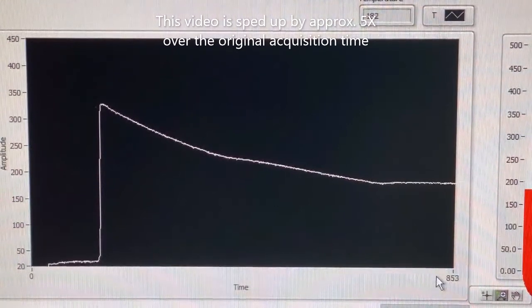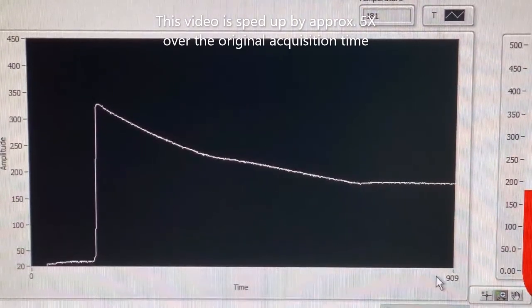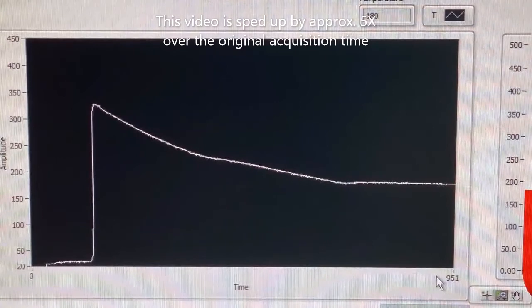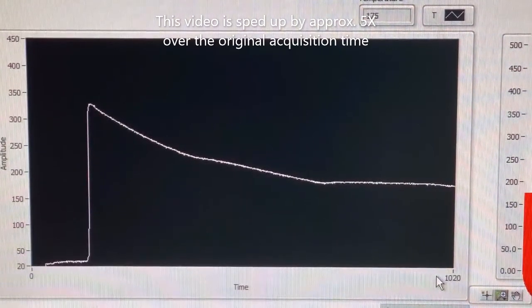So there is an isotherm here until all the liquid that was present when we reached 183 C transforms to solid, giving up the heat of fusion of that liquid. The eutectic liquid behaves quite similar to a pure element because there's a single temperature associated now with the transformation of the eutectic liquid into the solids alpha and beta.